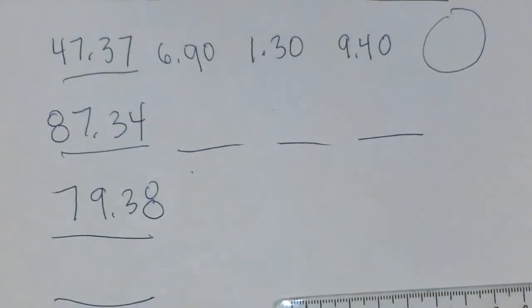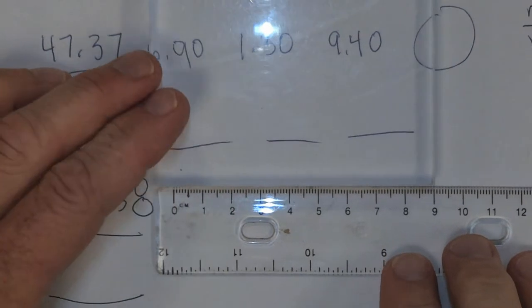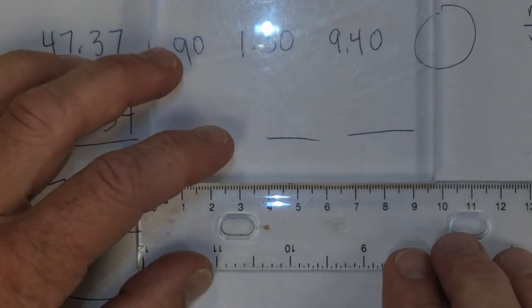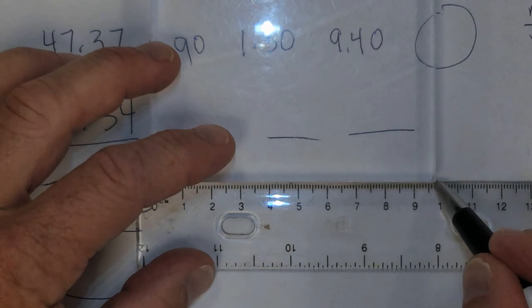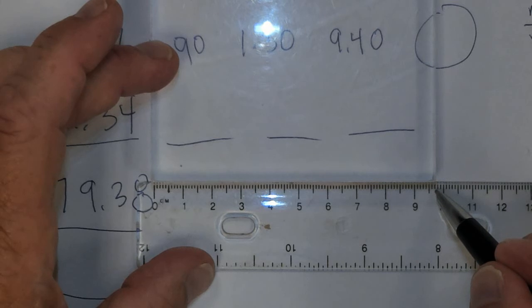.38 grams for the black block. All right, we got 3 down, we got 2 to go. Here's the clear colored block. Here's the length for that one. Let me get this one just centered on here just right. All right, should be able to take your measurement right down here. That's the edge of it right there. Whoops. Got it?